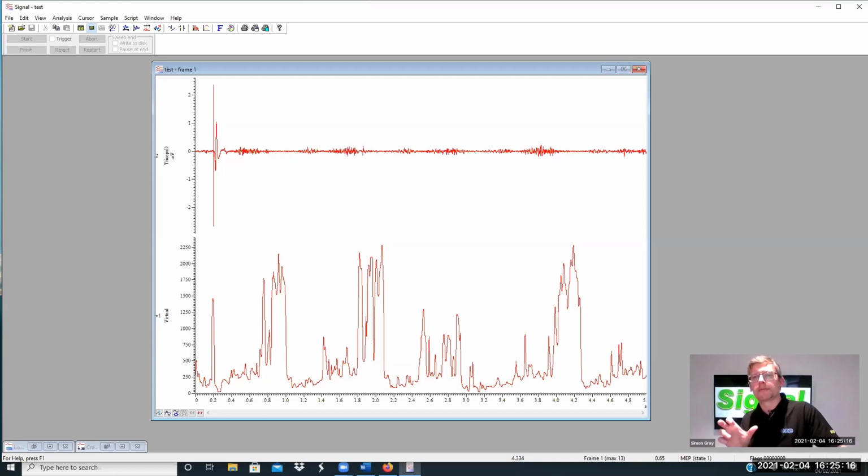Relatively short sweeps of data around a trigger, which could be the beginning of a stimulus waveform output for patching. This is so often used with short waveforms or short recordings for TMS, evoked response, auditory stimulation, etc. So small snapshots of data in response to a stimulus.